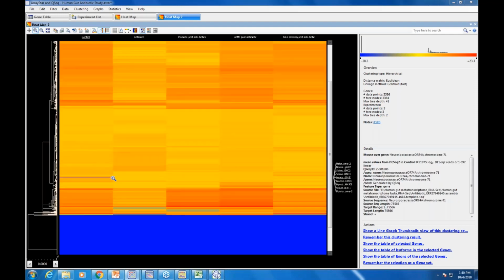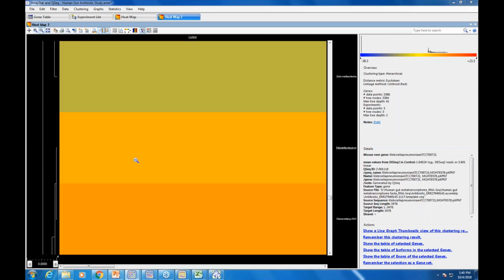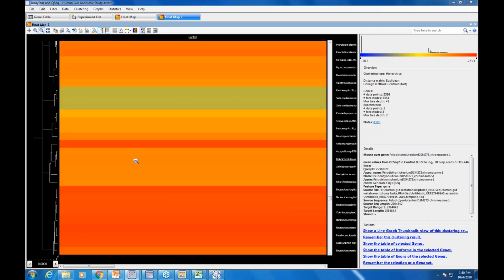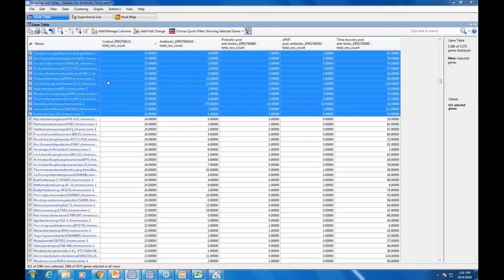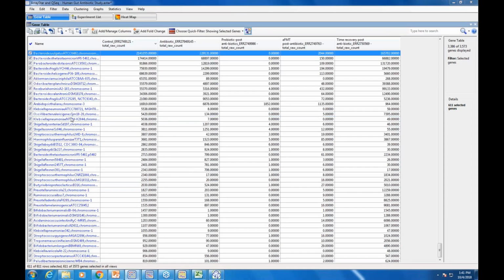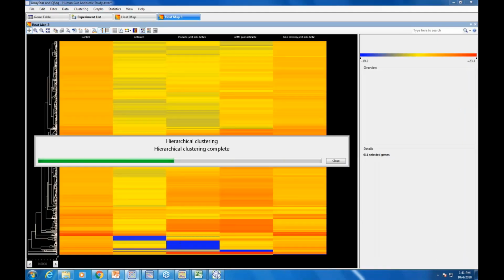And I can see lots of different patterns here, but let's zoom in a little bit. Oops, too far. Here, let's see. I want to reset that one. I forgot to do one little thing here. So let's select just those. So this is 611 rows now, and we're showing only those genes. Now we'll cluster just that subset. There we go. Okay, that looks better.